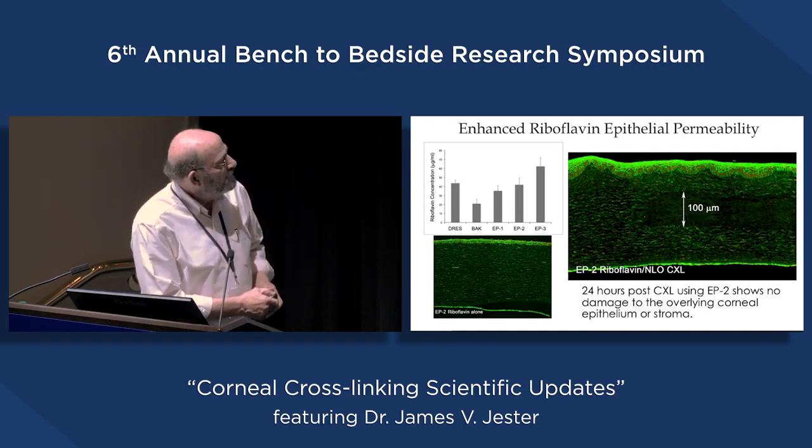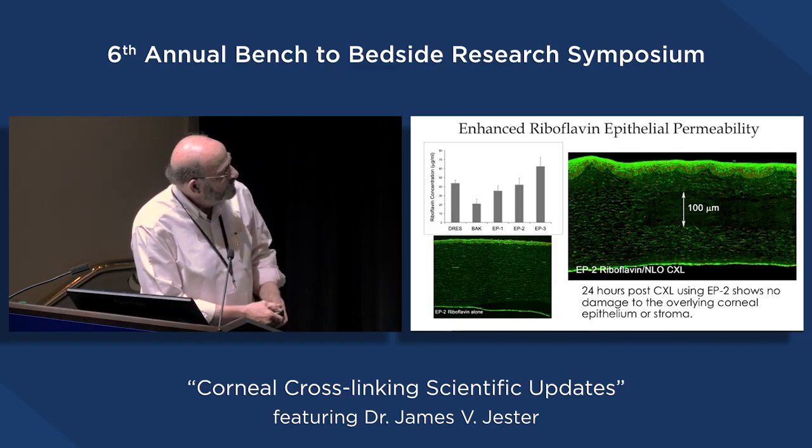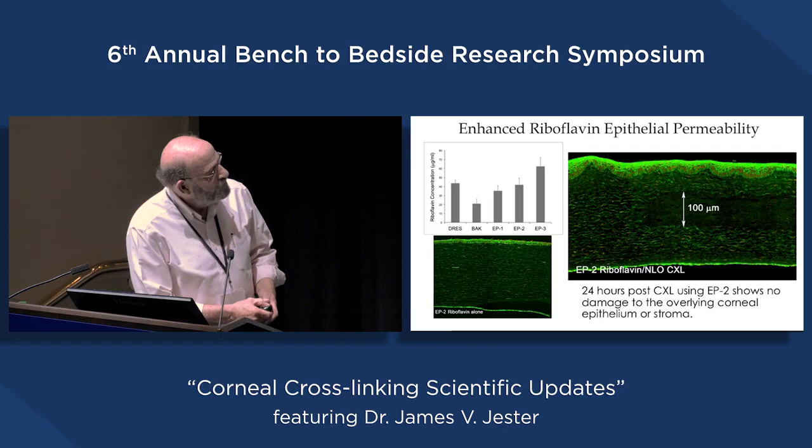This is after this EP2 exposure. You see no damage to the corneal epithelium in this cross-section, no damage to the stroma in this live dead. These live cells are green, also the corneal endothelium. We can also cross-link. This is the region of cross-linking.